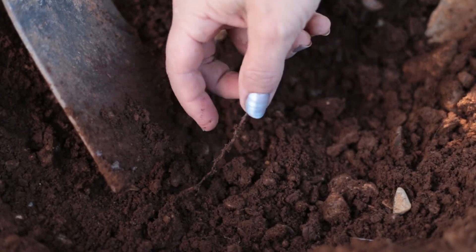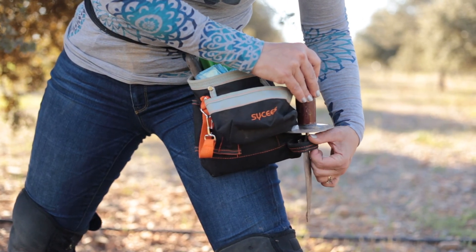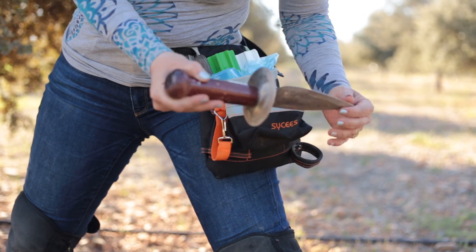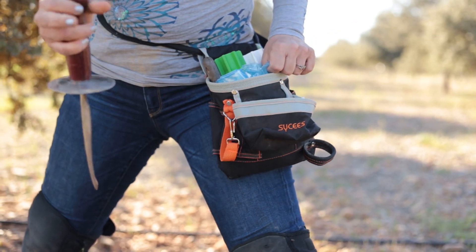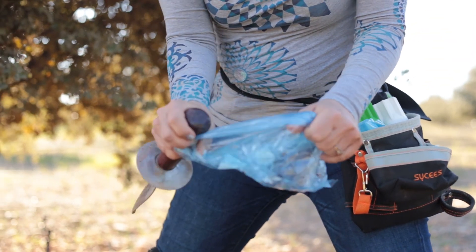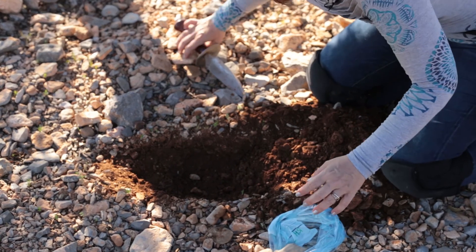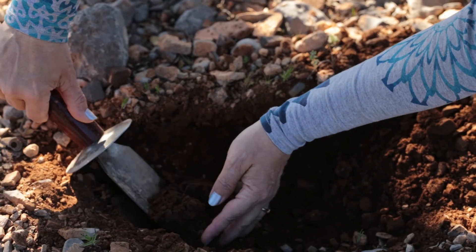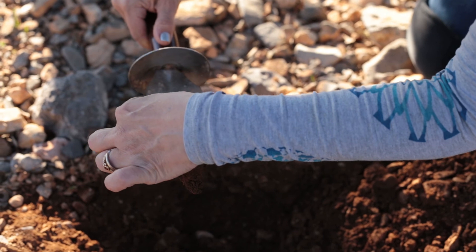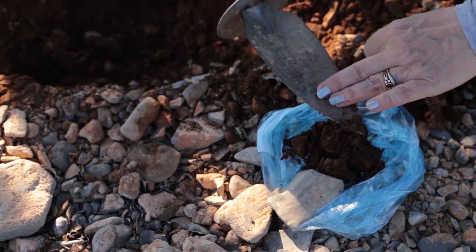Here we go — you can see we have some mycorrhiza on the sides and a fine root here, but most of the mycorrhiza are broken in the soil I just dug. You need to find something comfortable to dig with — we use a truffle knife, but just find a small trowel or whatever works. Further back we have a more or less fine root, so I'm going to dig it out with all the soil around it, since there are many little roots coming out of that root.